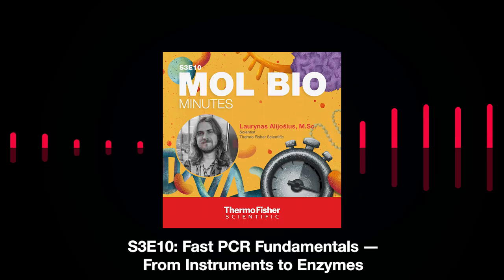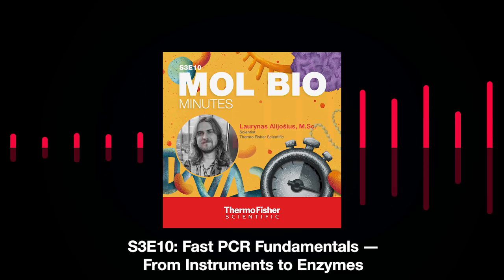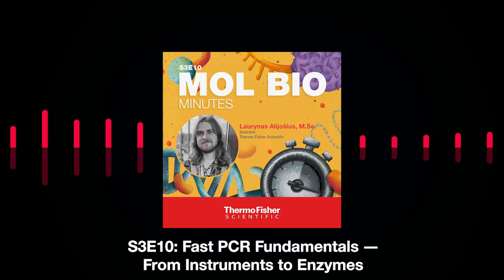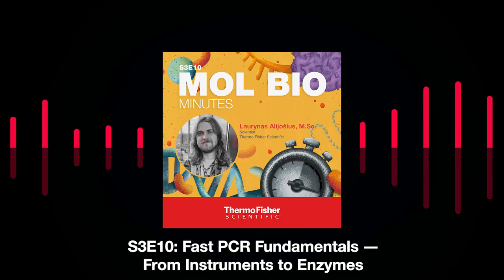The time is not the only thing we're saving actually. Using fast PCR instead of the standard one, you can make your PCR even more cost effective. With fast PCR, you would need fewer reagents per reaction. That means you can perform more reactions with the same amount of PCR reagent. It's also a sustainable choice, because less waste per reaction will be produced. And also, using shorter PCR programs on your instruments means that you will consume less energy.